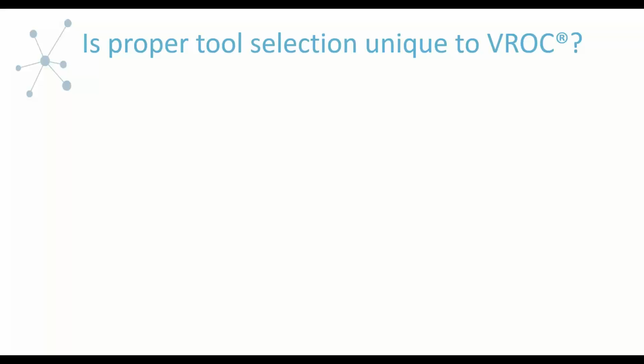Okay, so the section that I'm going to present today, Zach really focused on our technology, which is the microfluidic technology, but I thought it would be valuable to make an analogy to other common rheometers and viscometers for a couple of reasons. I know that some of the people joining us today might be new to our technology. However, they may have used rotational instruments or capillary tubes in the past. So I thought it might be helpful to better reinforce what Zach had been discussing by talking about something that's more familiar to them.